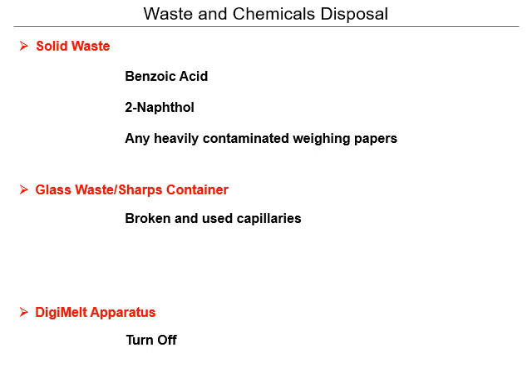So just a quick overview again. For this specific lab, we talked about melting point, which is the temperature at which your vapor, solid, and liquid are in equilibrium, and that temperature is based on the vapor pressure of the air in comparison to the vapor pressure of your solid or your liquid, where they're all happy and equal. For this specific experiment, since we're using a mixture of 2 different substances, we also have to look at the eutectic mixture and the eutectic point. The eutectic point is the lowest temperature at which your mixture of substances melts. And the eutectic mixture is the ratio of those 2 or more substances you have at the eutectic point.